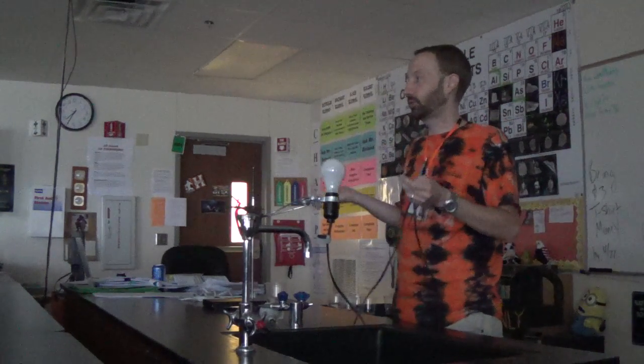Okay, so, why? Because I put my finger in it. It doesn't ionize. It knows better. What doesn't ionize? The water. Well, it's the first criteria. Dissolve. What's in deionized water? Nothing. Exactly. This is absolutely, totally pure water. There is nothing in it. Nothing dissolved means nothing could be ionized. You are safe in a bathtub full of pure water.